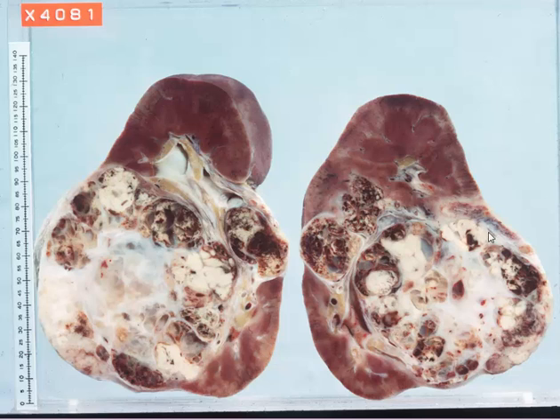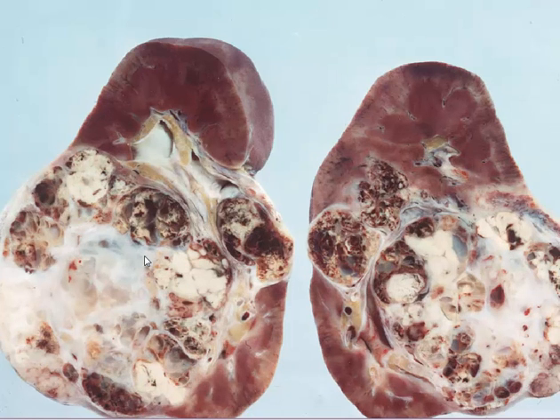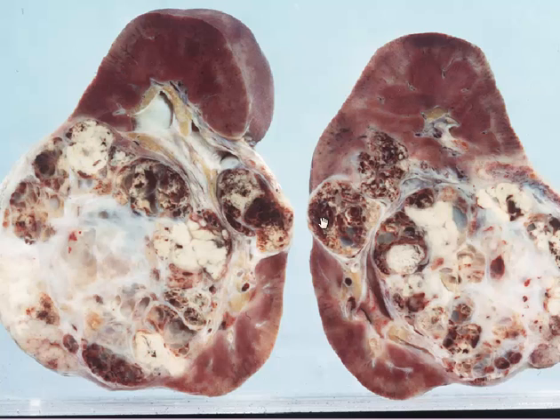It's worth taking a look at some of the features of this mass, and the first thing I'd draw your attention to is its variegated nature, or the heterogeneous nature of its cut surface. You can see there's a lot of variation in colour, but also in texture. Firstly, you might notice the large areas of pale tissue centrally in this tumour. This area here, and bands of it extending out into the surrounding tissue structure, and in some places joining with this pseudocapsule of the tumour.